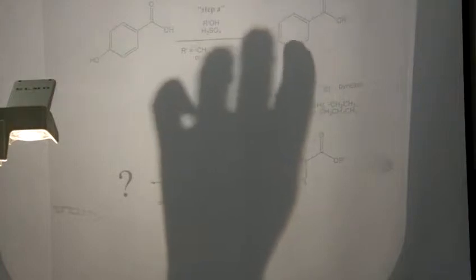So then this week, we are going to make an ester. We've got an ester here. We're going to make this compound into a diester. We're going to have an ester on either side. The attachment's just going to be a little bit different on this side than on this side. To do that, we're going to take our methyl 4-hydroxybenzoate and react it with an acid chloride in the presence of pyridine, and then we will get our diester, okay? Where your acid chlorides come into play is what R group you are supposed to have.